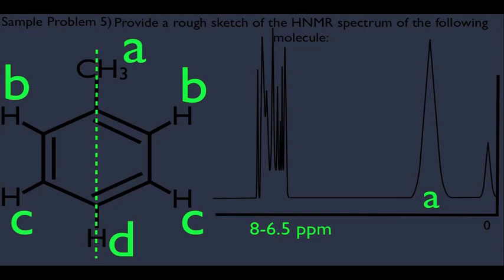If you were on a multiple choice exam, you would definitely at this point rule out any answers that don't have a benzene ring in them, or you'd suspect those first as possibly being the answer. Now let's look at those A hydrogens. They are not directly connected to the benzene ring, but they are technically not too far from it, so they would peak at around 2.3 ppms or delta units.